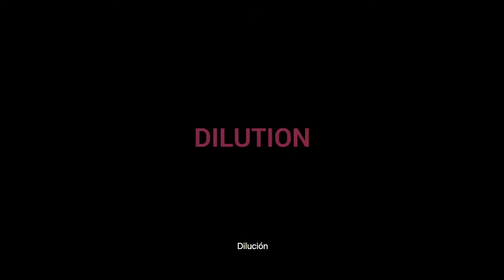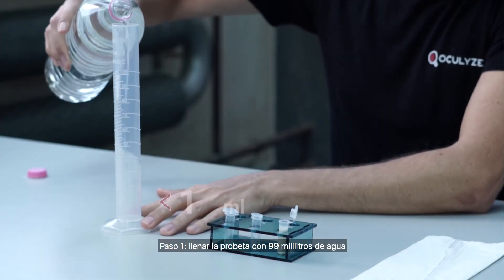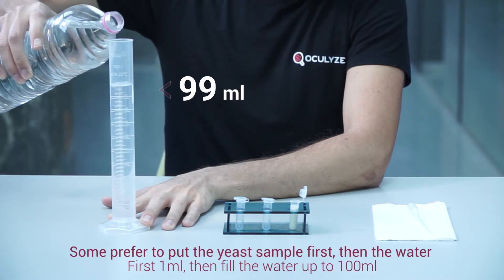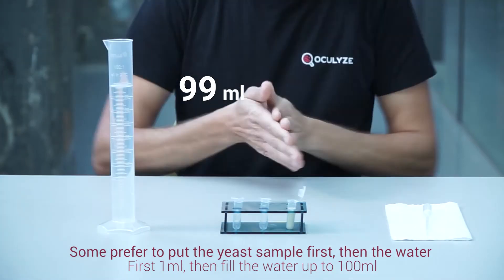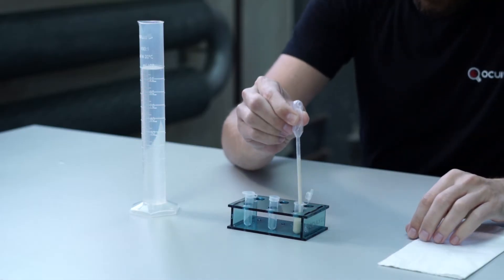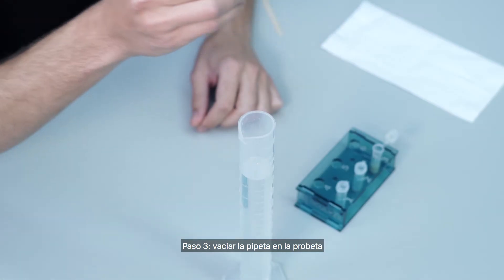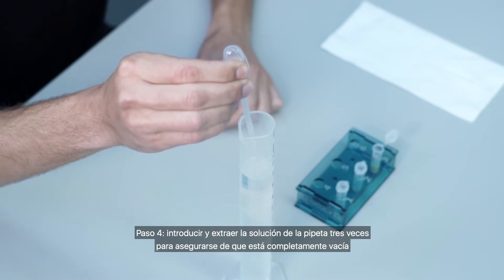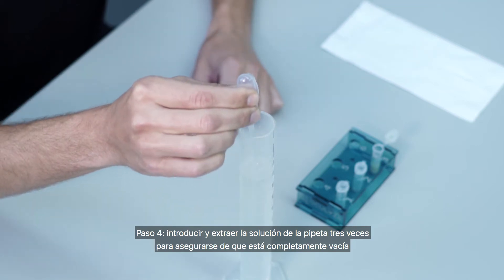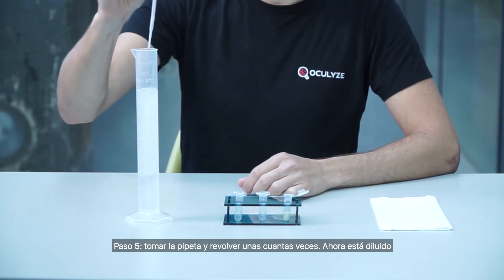Let's begin with dilution. This is what you'll need to make sure your yeast is well mixed. Step one: fill your measuring cylinder with 99 milliliters of water. Step two: fill your Pasteur pipette with yeast to one milliliter. Step three: empty the Pasteur pipette into the measuring cylinder. Step four: run the solution in and out of the pipette three times to make sure it's completely empty. Step five: take the Pasteur pipette and stir a few times. Now it's diluted.